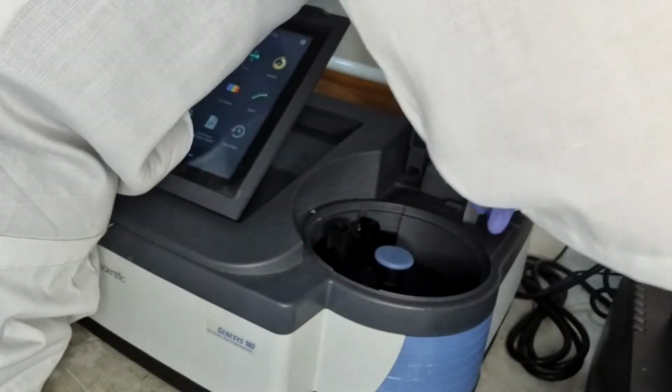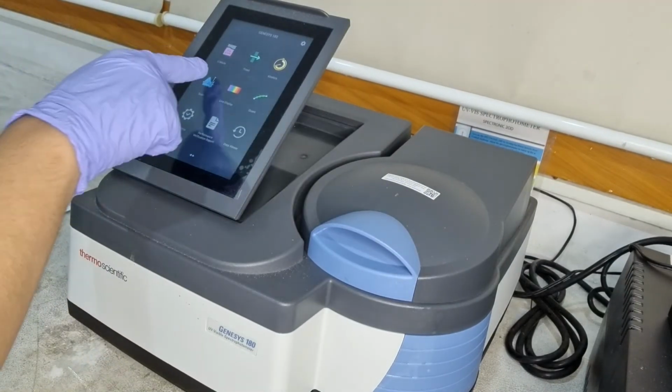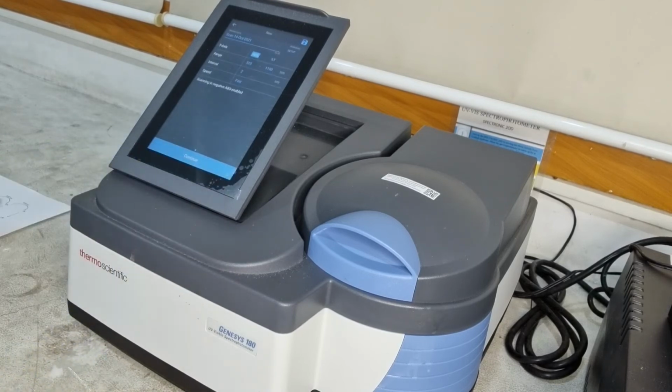This is a double beam spectrometer which accepts a blank at the same time as the sample. I've gone ahead and placed my blank in another cuvette, and this ensures that the reading has taken into account any absorbance from the solvent and other factors.